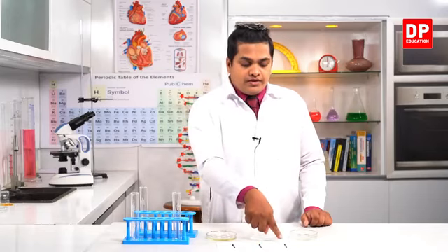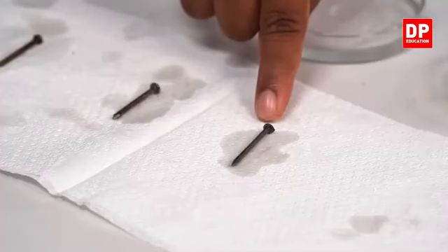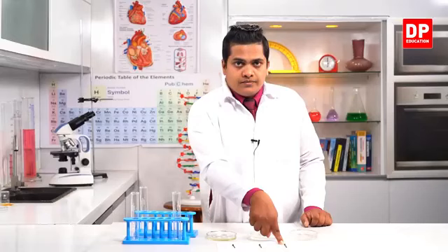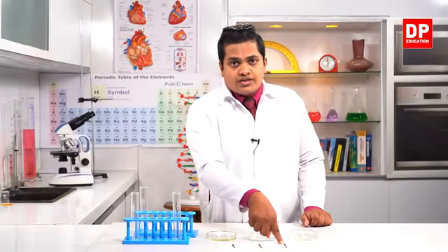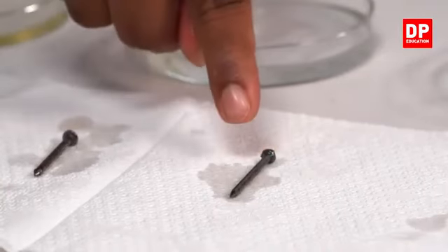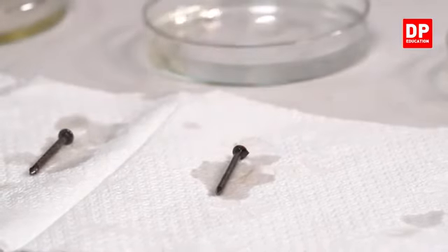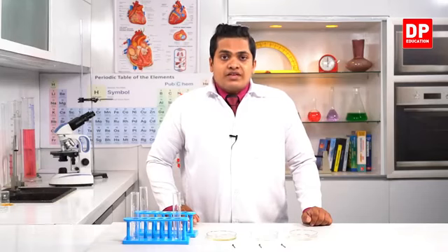Now the third one, the final one, boiled water plus coconut oil. There is no rust at all. You can observe there is no rust at all. See? So these are the observations from this experiment.